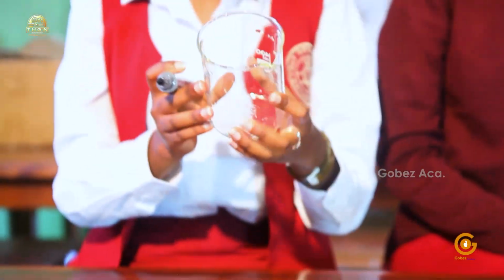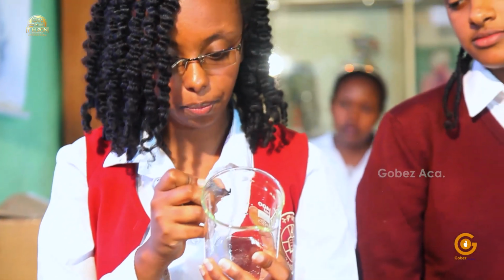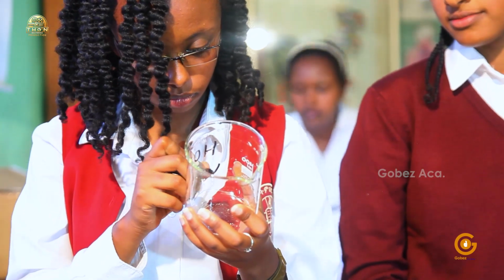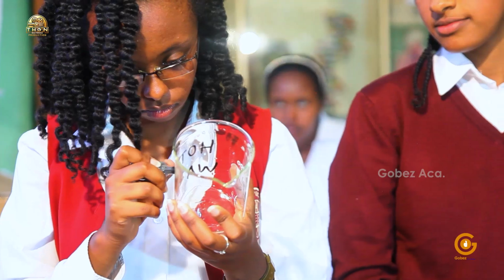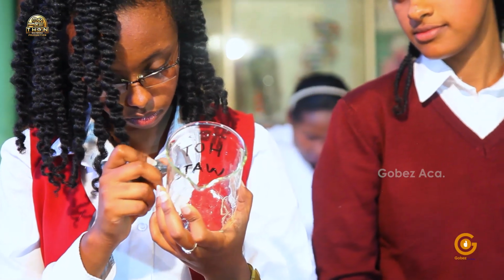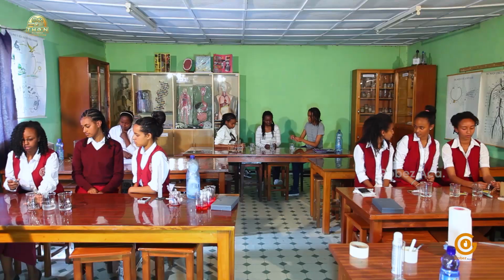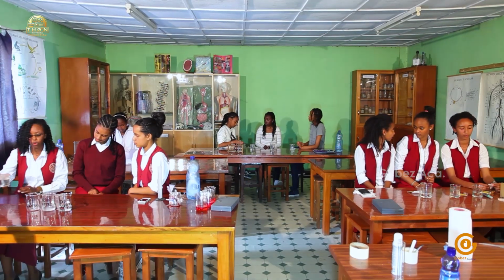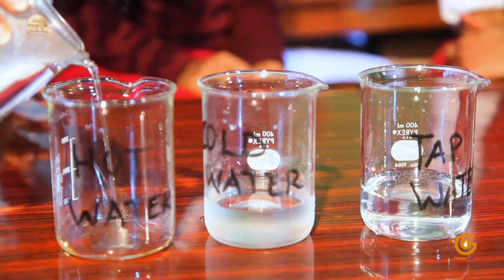Like before, I write hot water on the third beaker. And carefully pour boiling water into it.